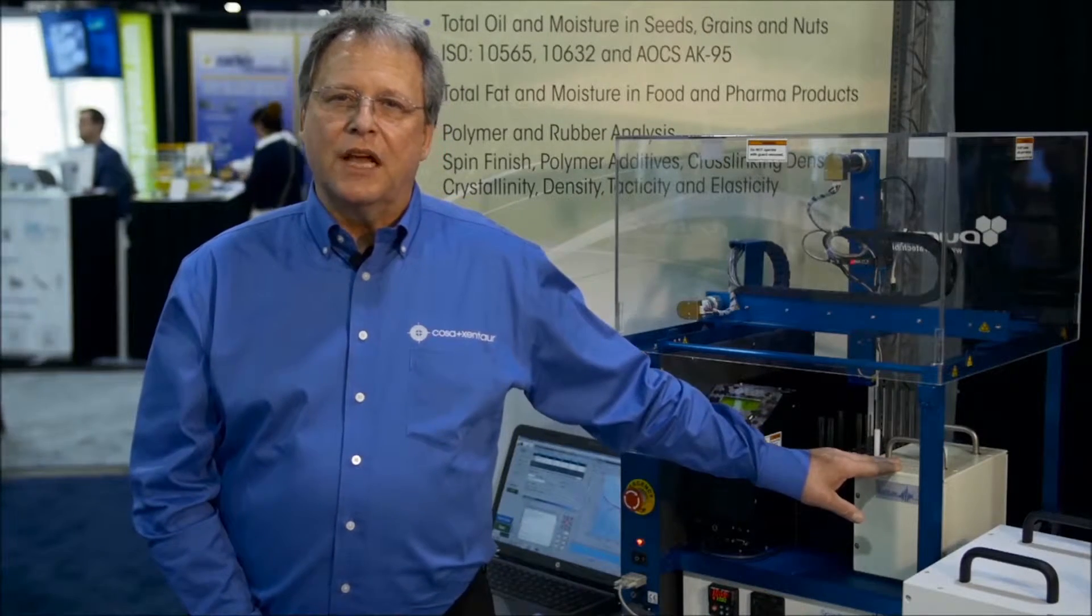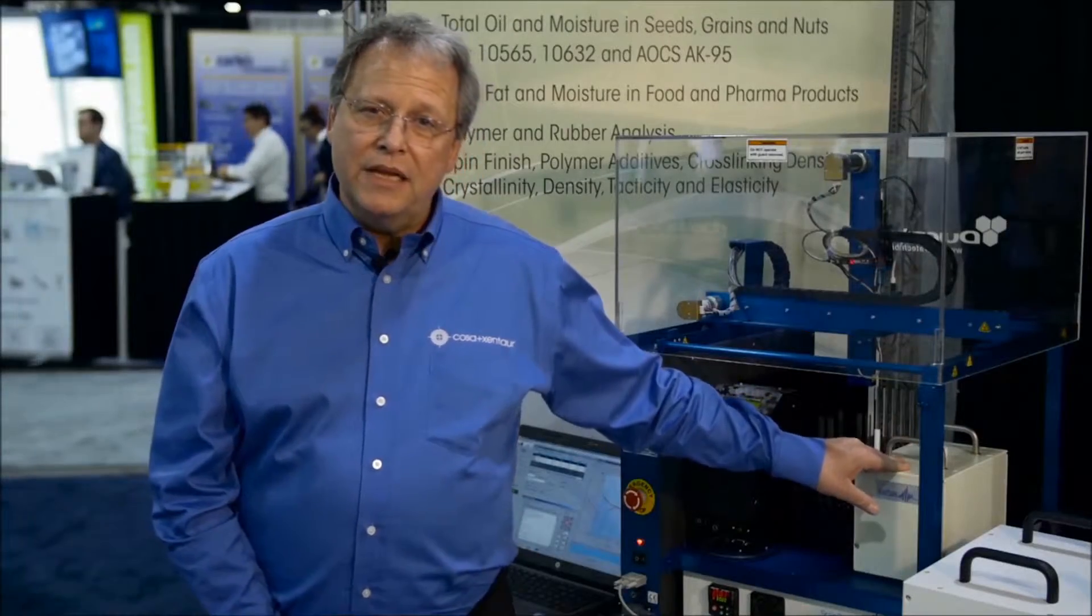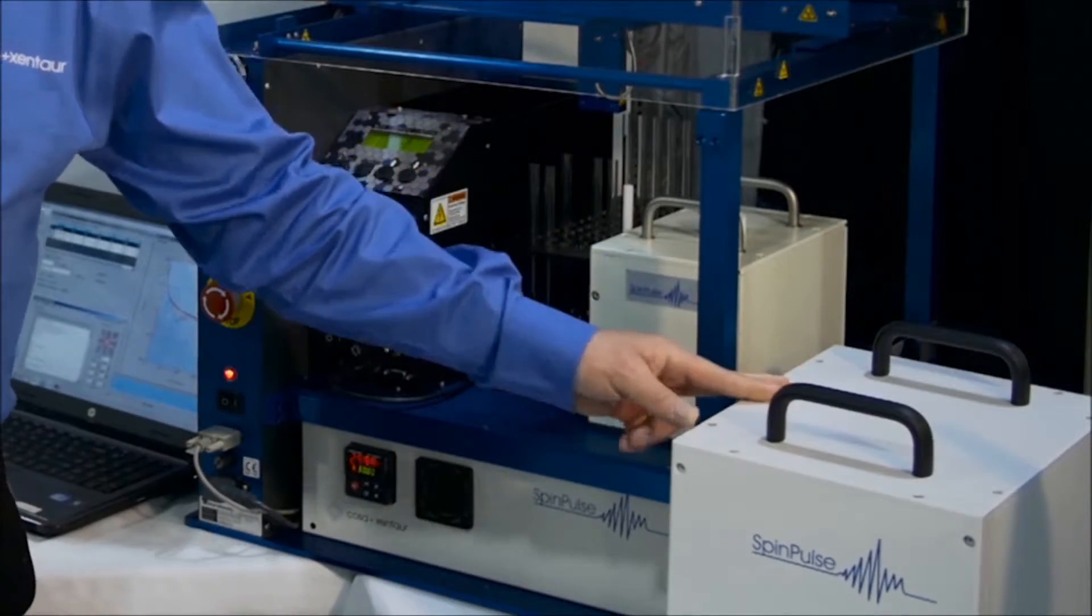What magnet you choose depends upon the sample size and type of sample you're measuring. It comes in three basic configurations: a 10 mil magnet, a 20 mil magnet which as you can see is much larger, and then the 40 mil magnet that's the same footprint but a larger sample.